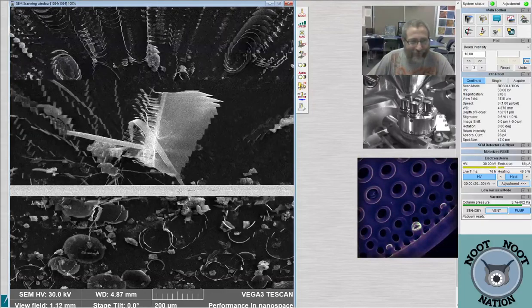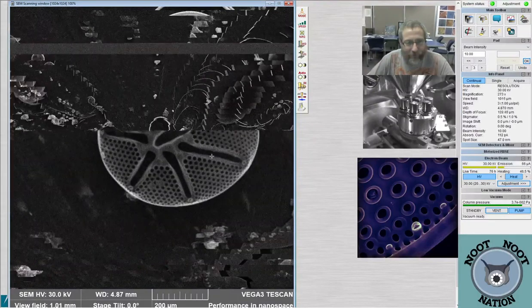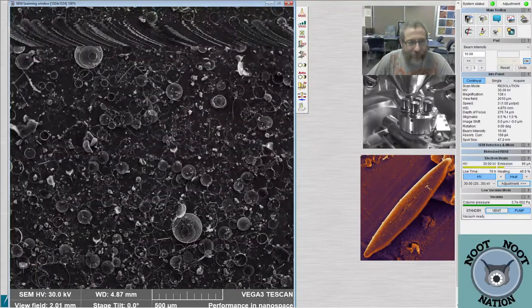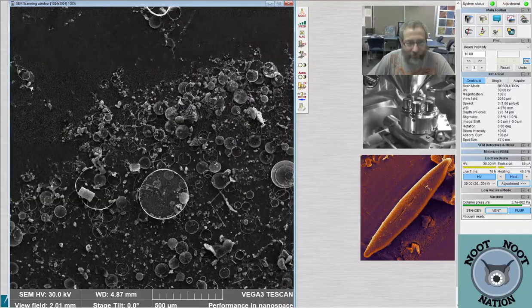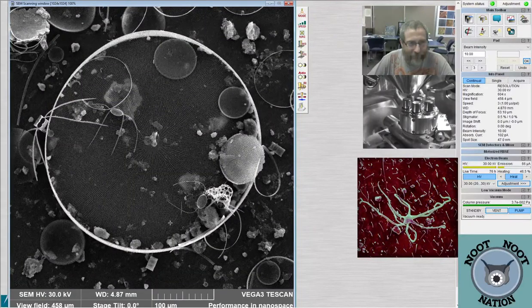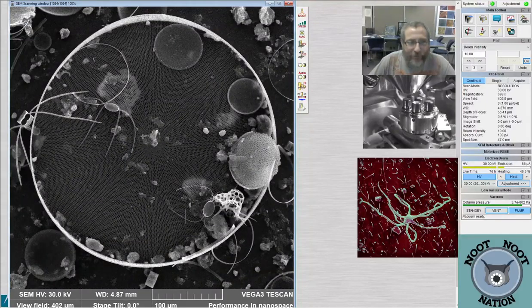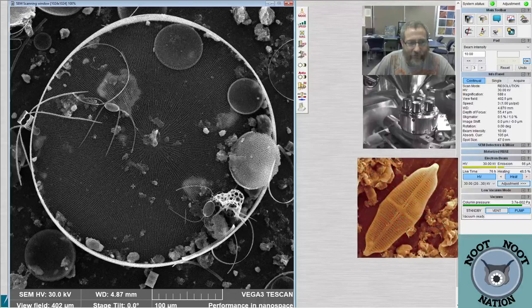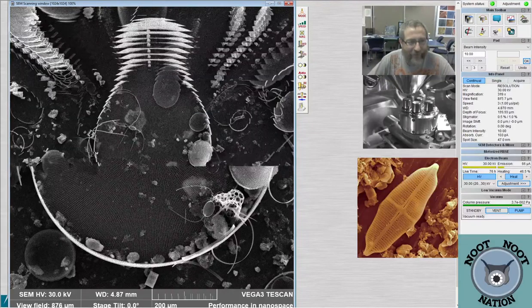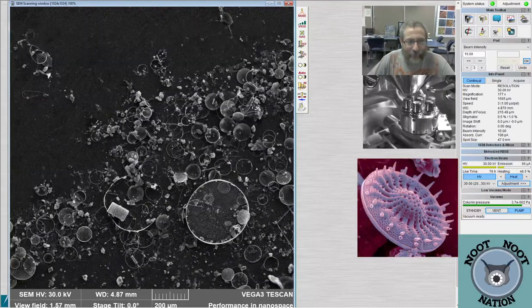That's the regular old Distephanus. Yeah, that is. There's an internal view of Asteromphalus. Yeah. The Starbelly diatom. Starbelly. And here's a giant. Oh, whoa, interesting. Wait, look at, are those... No, it's dirt. This is your Thalassiosira wailesii or whatever. Yeah, look at the giant Thalassiosira that look like they're tiny on this thing. They do! Huge. Yeah. That one came to play. That's a big one.